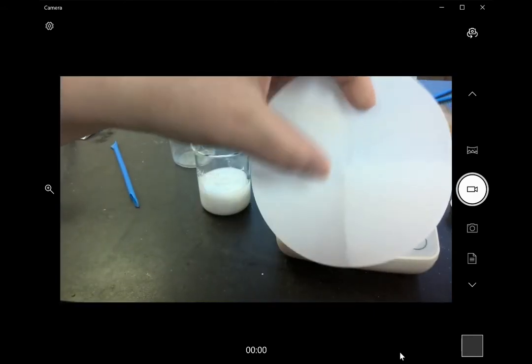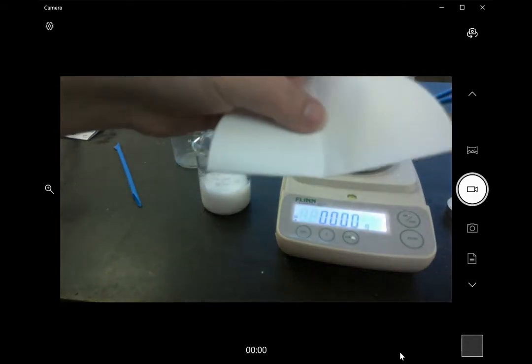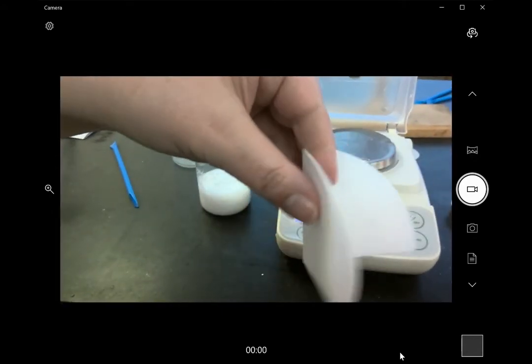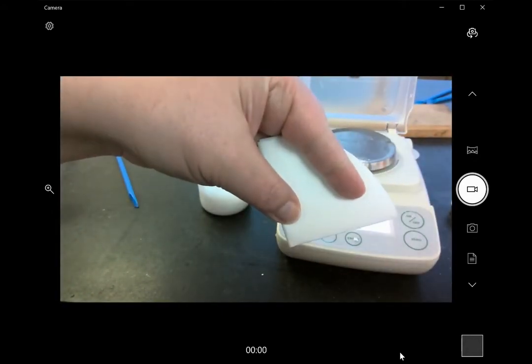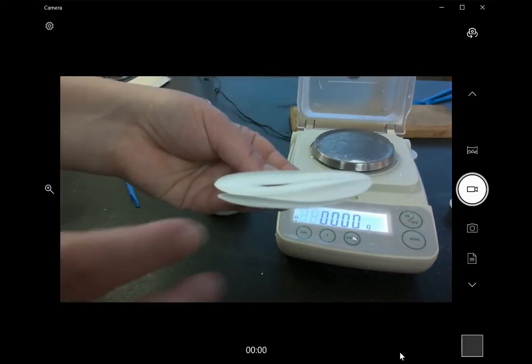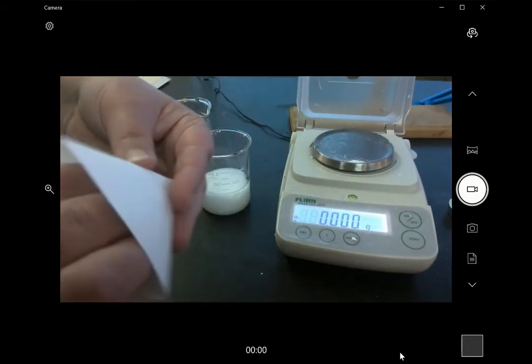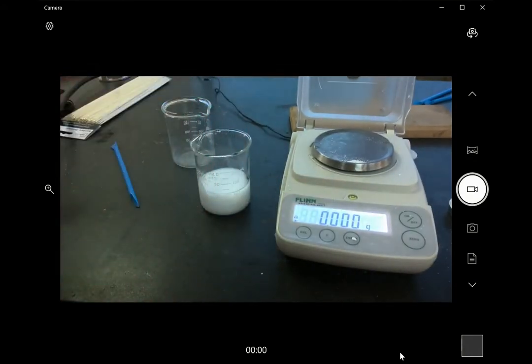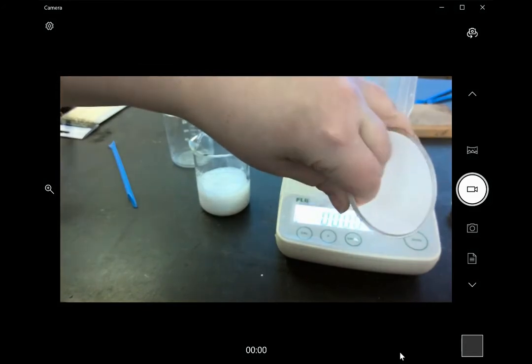I'm going to fold my filter paper in half and then in half again so that I get this funnel shape. And when I open it up to put it in my funnel, I'm going to make sure I have three layers on one side, one layer on the other side, so that it fits into my funnel like this.